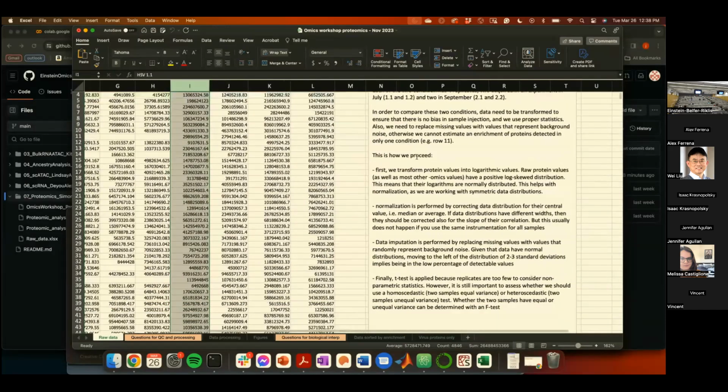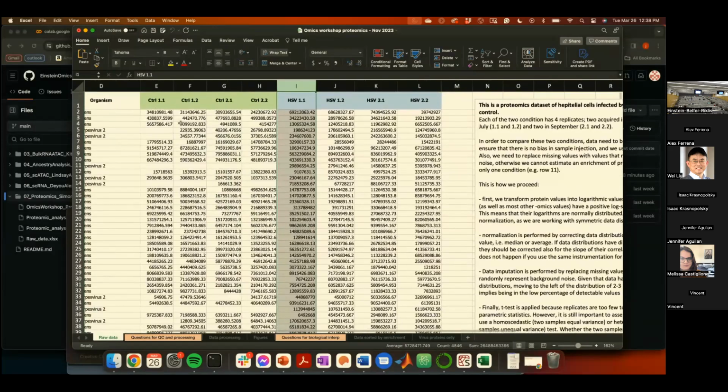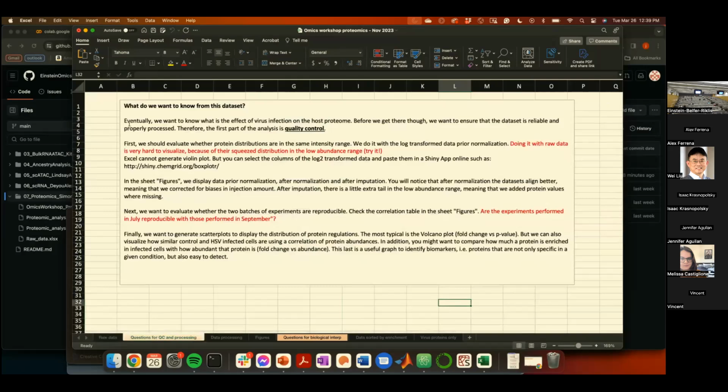What we're going to do through this vignette is take this raw data into things that you can actually interpret, and give you the tools on how you can interpret beyond the first 2 dimensions that Simone talked about, more on the interpretation. As I keep showing you this workbook, we have different questions we want to address during this vignette. We want to look at how the raw data looks, and how, after we transform the data, that also looks.